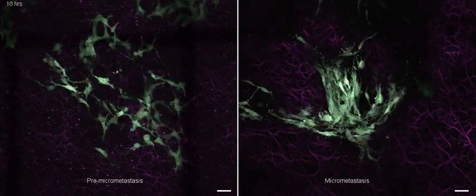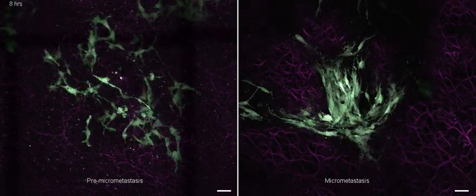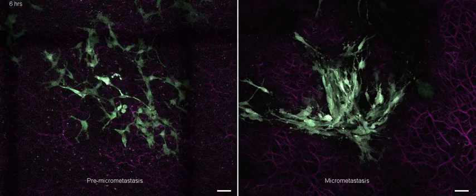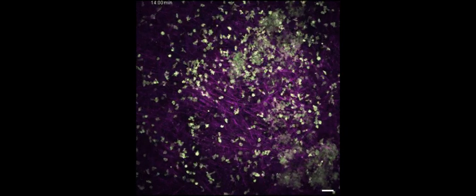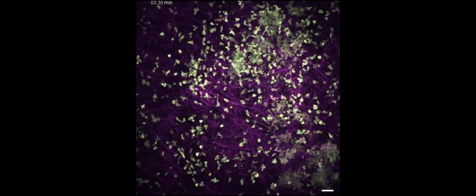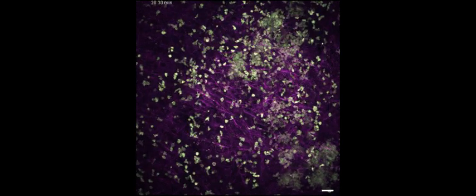If we block the motility in the pre-micrometastatic phase, these pre-micrometastases cannot grow into a micrometastasis. What you will see in movie four are T cells that are stimulated with OVA peptides.